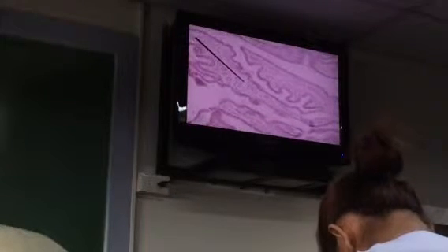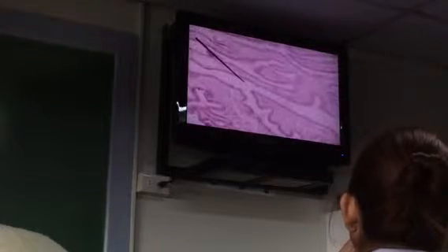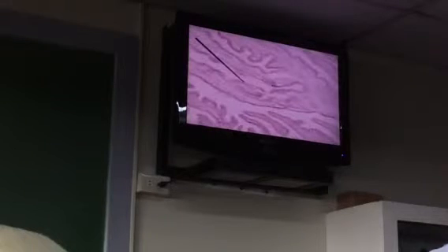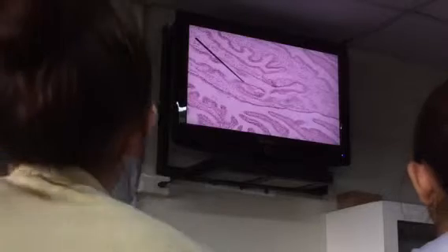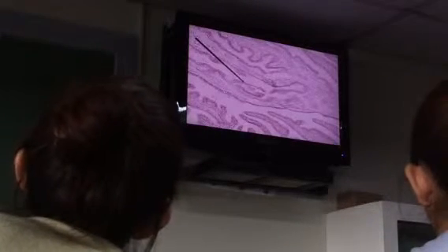Yung lamina propria natin. What is more important when you speak about the fallopian tube? I noticed, by the way, that the mucosa is thrown into folds. No? I'd like you to study these enfoldings well, because you see enfoldings again when you get to seminal vesicles, baka makamali ninyo.